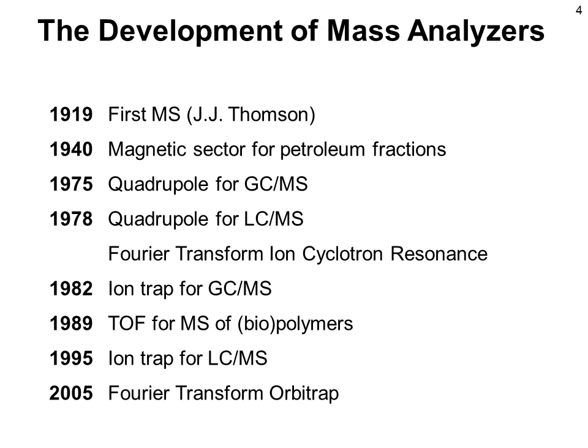However, with the advent of new ionization techniques such as electrospray, this has become quite a routine method to date, and liquid chromatography mass spectrometry is the main and most important method in bioanalysis.